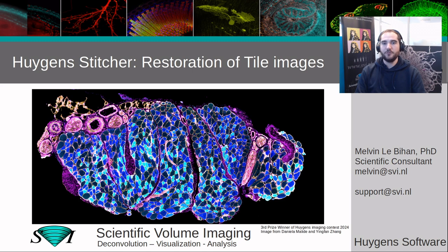I am a scientific consultant at Scientific Volume Imaging, and today I will present an overview of the Huygens Stitcher, highlight the latest update of the stitching module, and at the end of the webinar, provide a quick demonstration of how to stitch an image with Huygens.